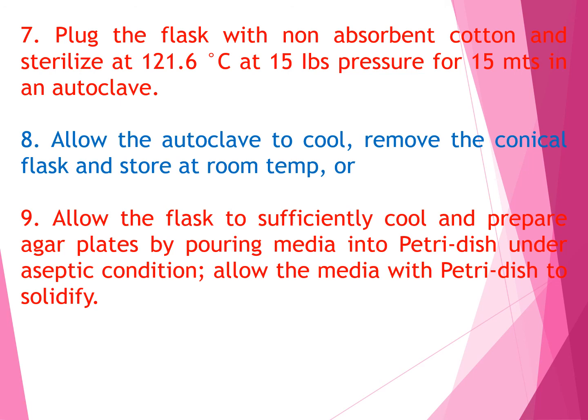Plug the flask with non-absorbent cotton and sterilize at 121 degrees Celsius at 15 psi for 15 minutes. Allow the autoclave to cool, remove the conical flask and store at room temperature. So these are the two media and the procedures for preparing them.